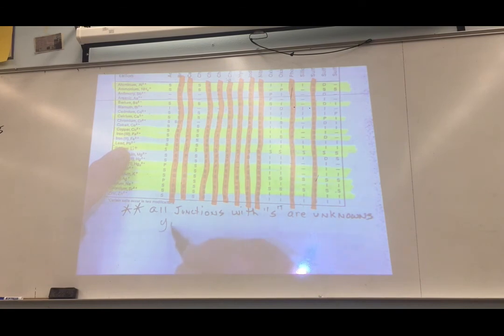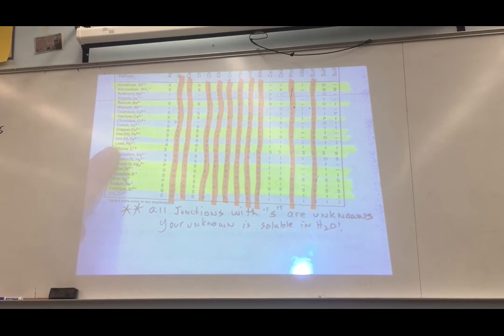So your unknown is soluble in water. Okay? Your unknown is soluble in water.